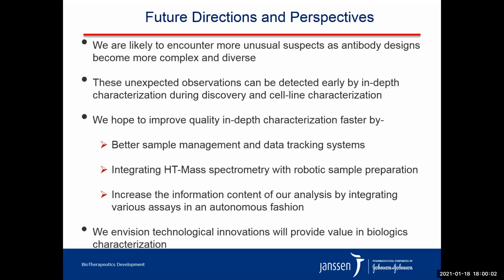So, as future direction and my personal perspectives, as antibody designs become more complex and diverse, we would expect more unusual suspects to exist in our analytical data. Improved methods and capabilities that speed up characterization in early discovery without compromising quality is therefore essential.